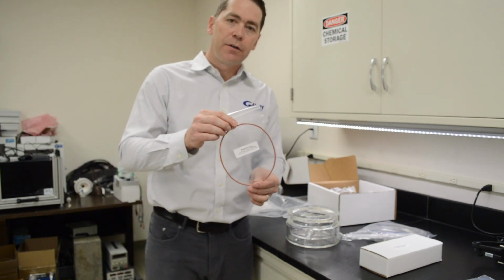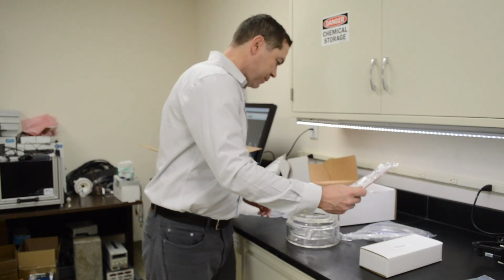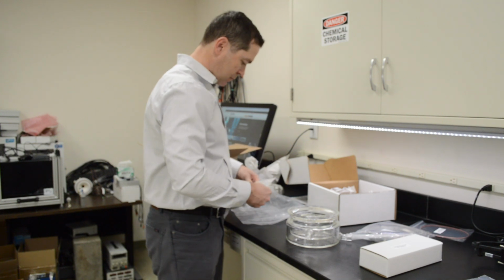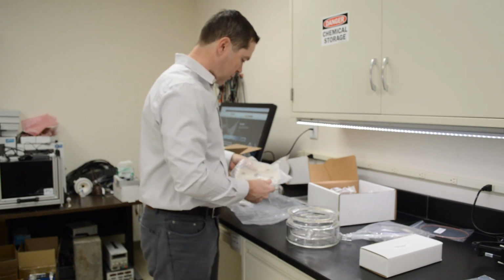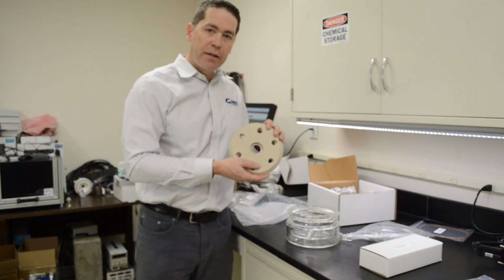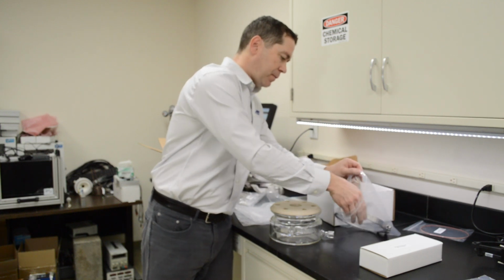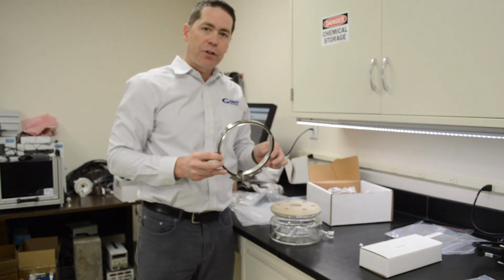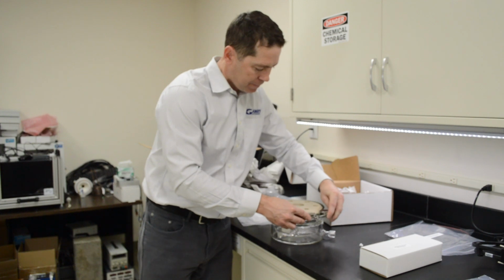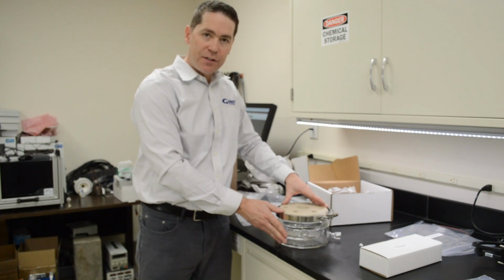So as I said, there's a PTFE coated O-ring here that will fit in this little depression. On top of that then would go the top, this PEEK top, like so. And we have this flange clamp, of course, that goes around to secure the lid to the glass cell itself.